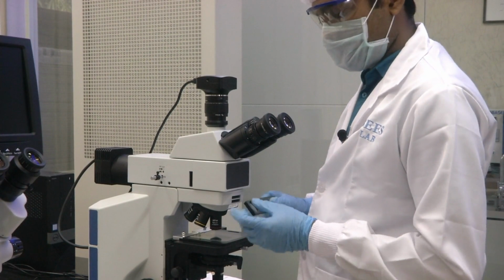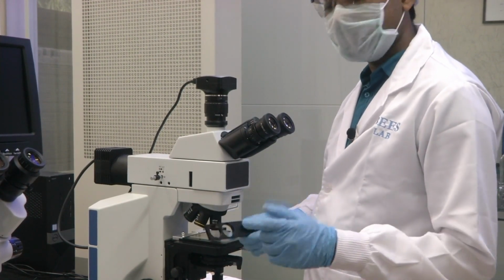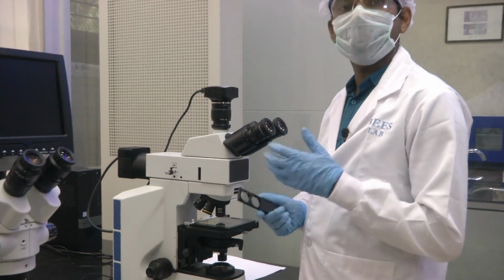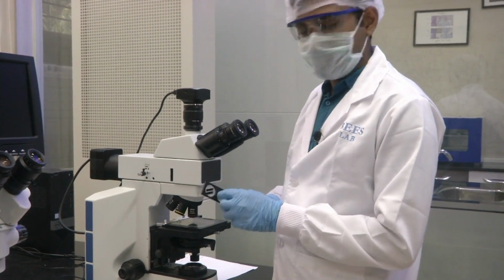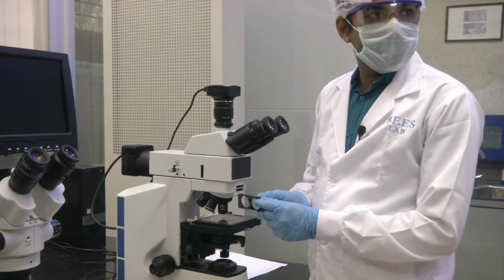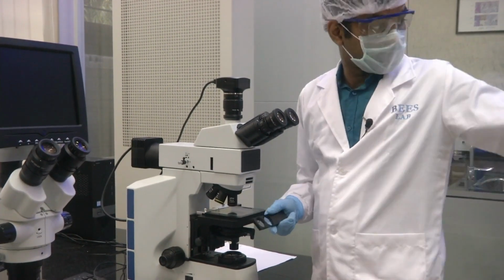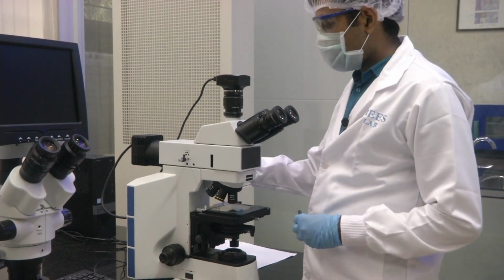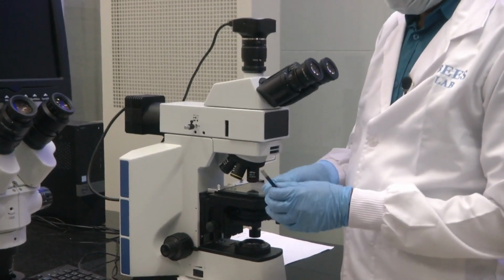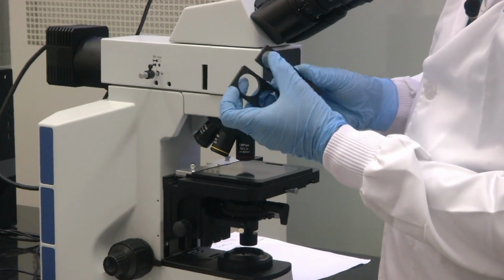How much of your source light actually falls on your sample. So if you want to adjust that, you can, but that is not basically what this is used for. That is also a good utility, but more importantly this can be used for putting filters, like color based filters, like red filter, green filter, blue filter, etc. Some filters will be there which you can insert here. Then you have one more similar arrangement for multiple filtering here. See, it is a similar one, but just that it is a smaller radius.